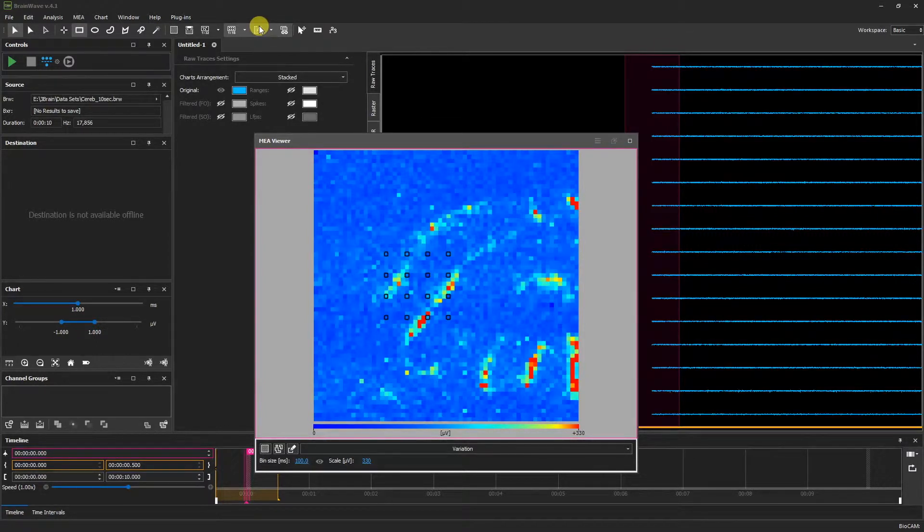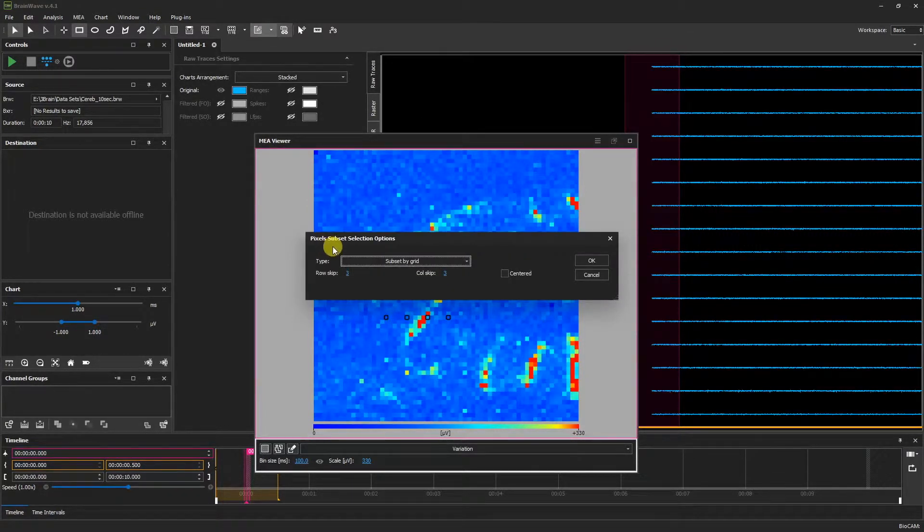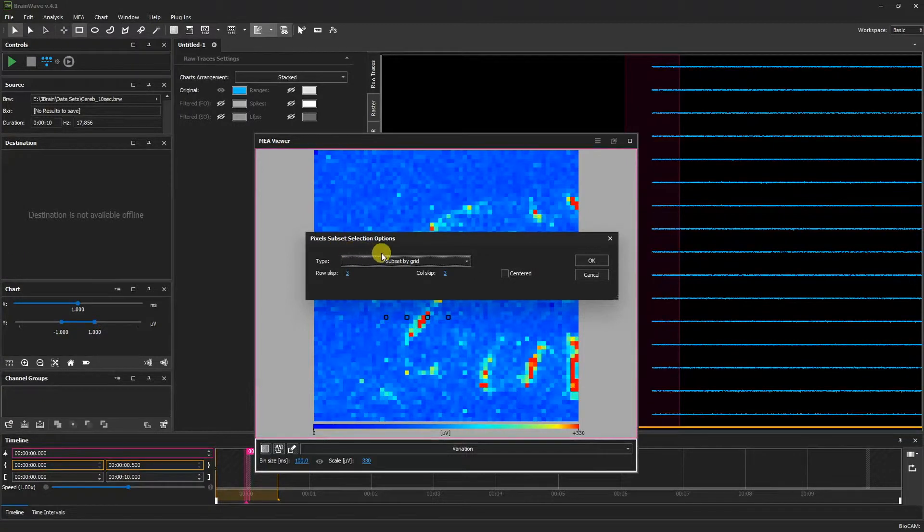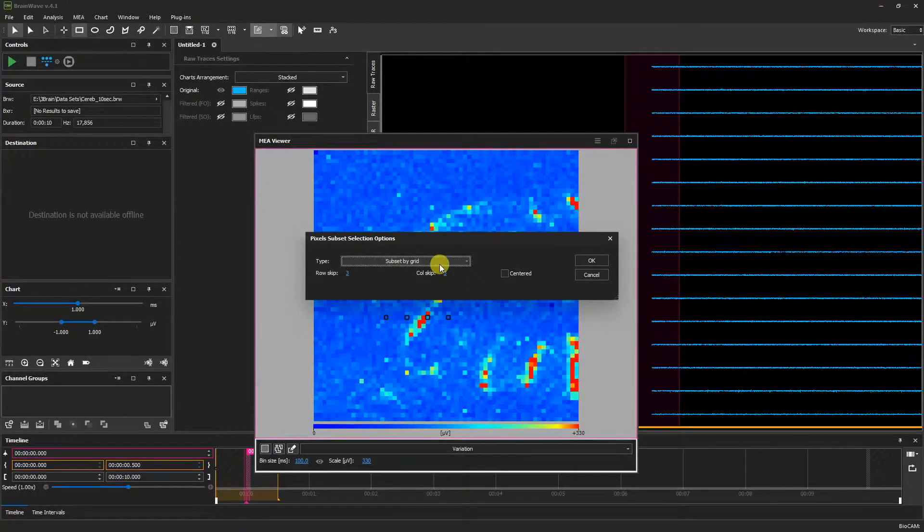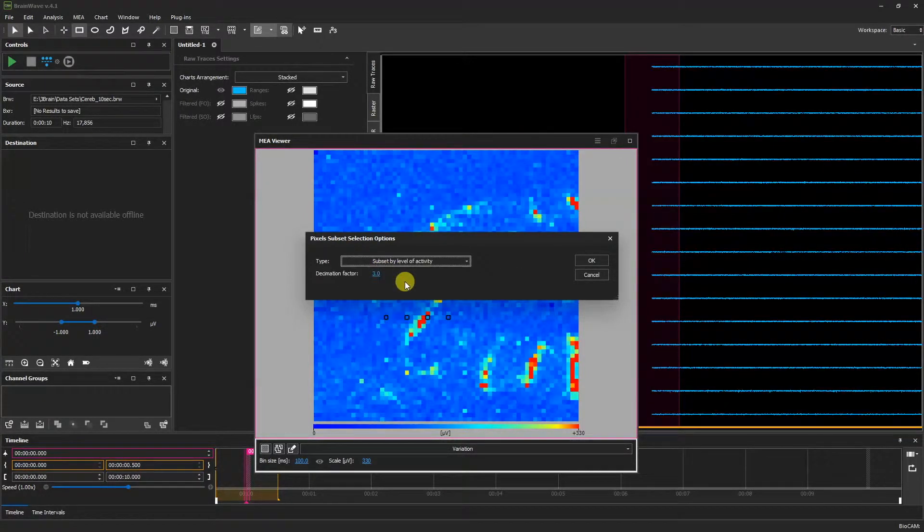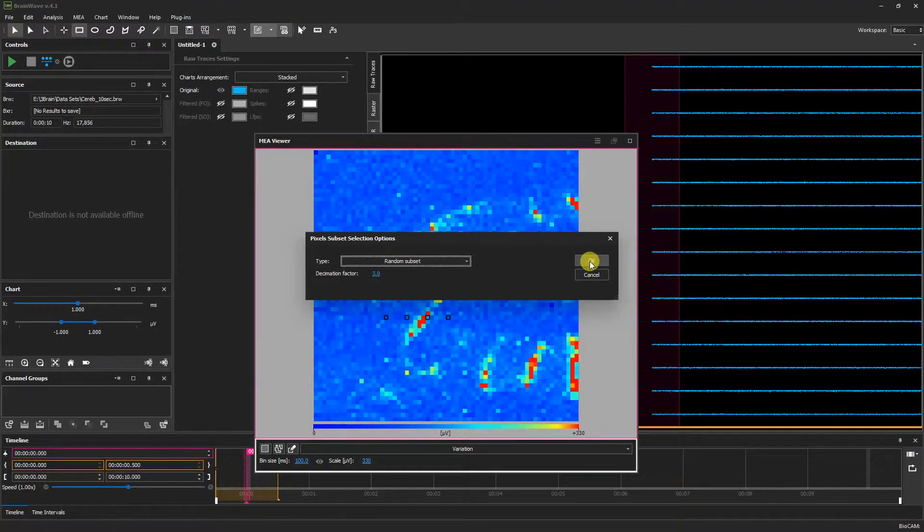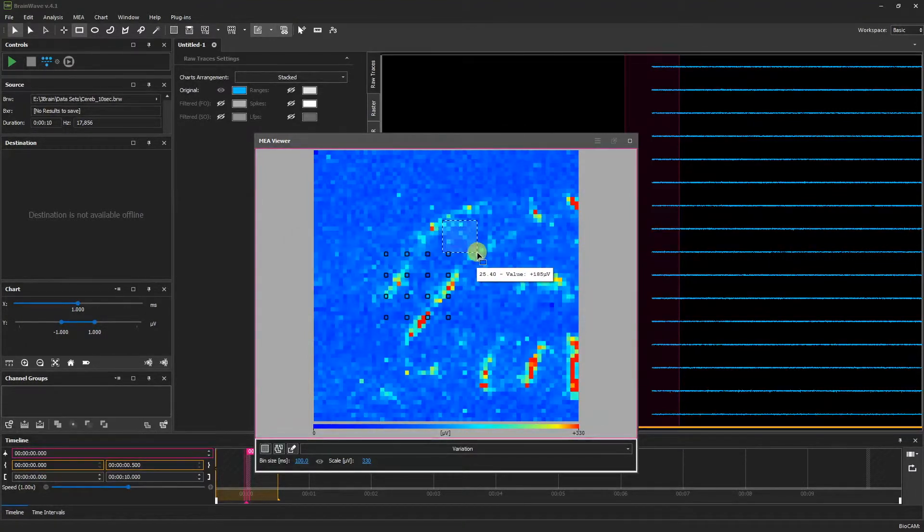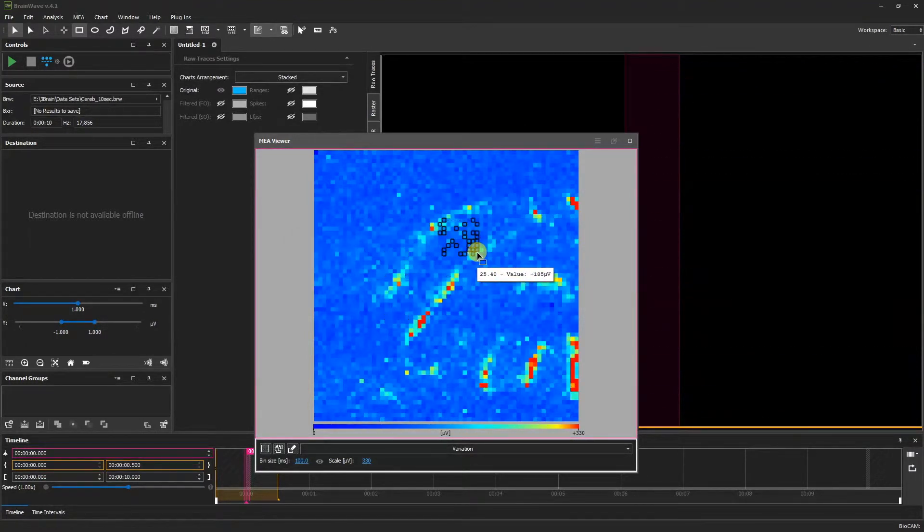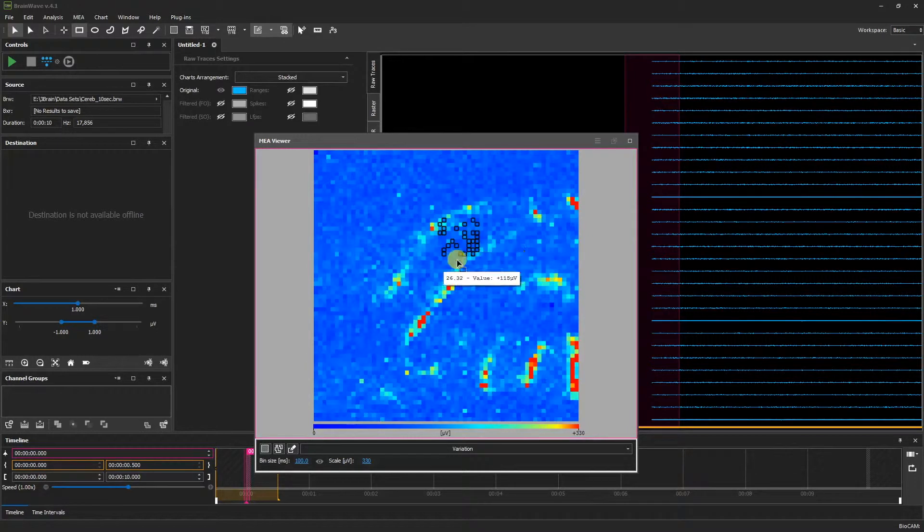We can also select by other parameters. By going to the pixel subset selection options, we can choose to have a subset by grid, a subset by level of activity, or a random subset. When we select, we see a random selection.